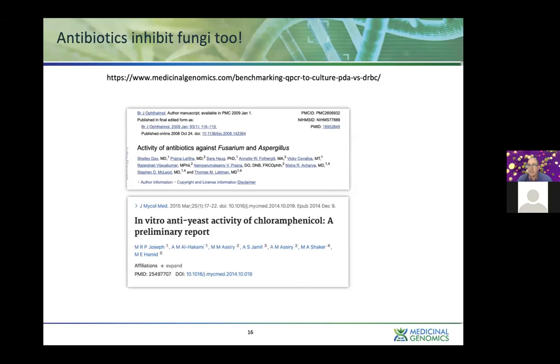We have Aspergillus, and public literature shows that Aspergillus is hindered by things like DRBC. The chloramphenicol antibiotics that are present on this reduce its growth. We have got evidence of it in our PCR data and sequencing as well. This is getting pushed upon all the labs in Michigan to uproot all the gear that they've purchased in the past, put in new gear, and switch to something that's less sensitive, all under the banner of patient safety, when it's actually going to be worse.